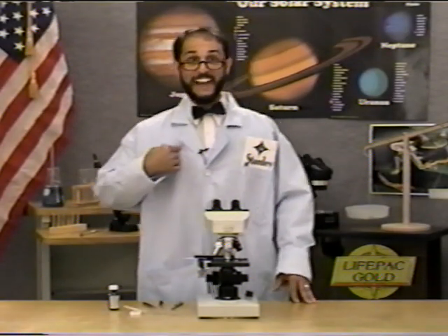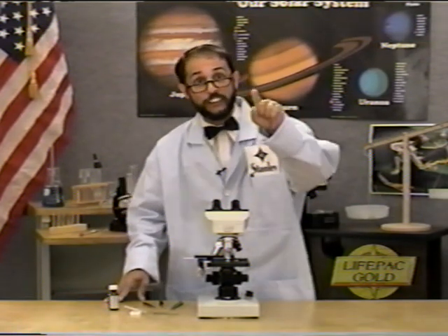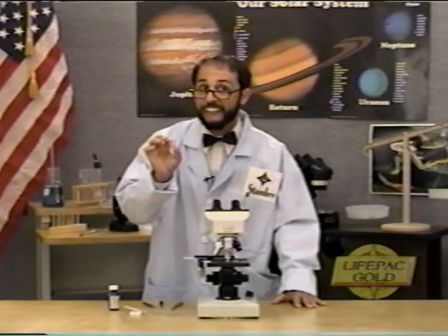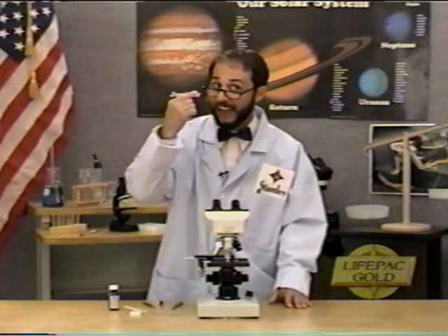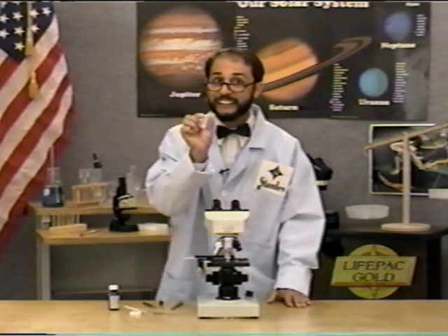Hi, I'm Stanley the scientist, and today we're going to see what you're made of, literally. We're going to look at cells. Cells are the tiny units for all living things. Cells are so small that they usually can't be seen with the naked eye. We call them microscopic, micro, because they're so small.